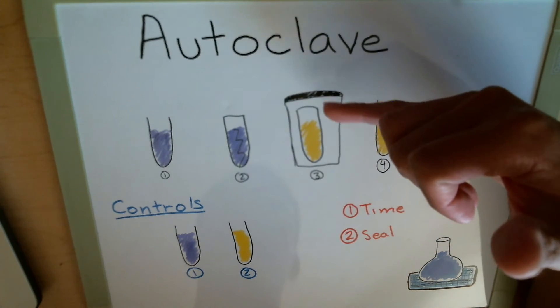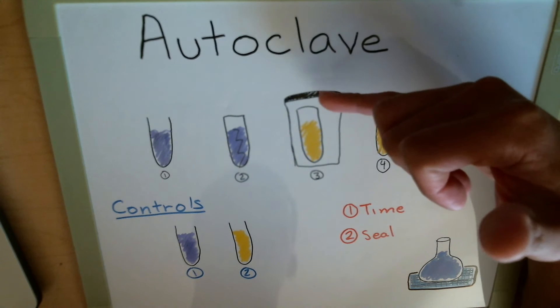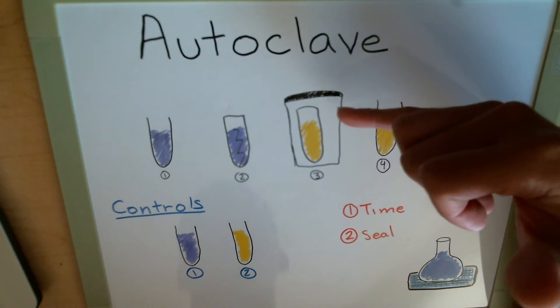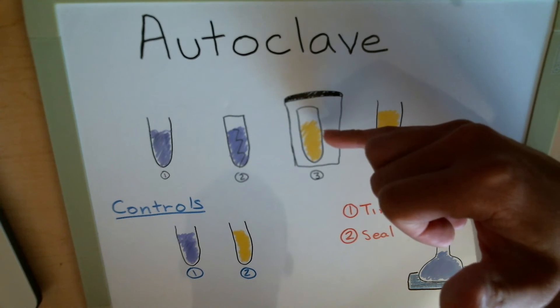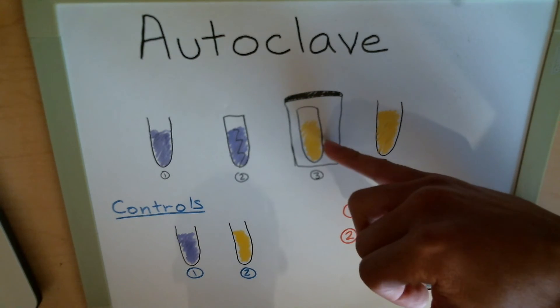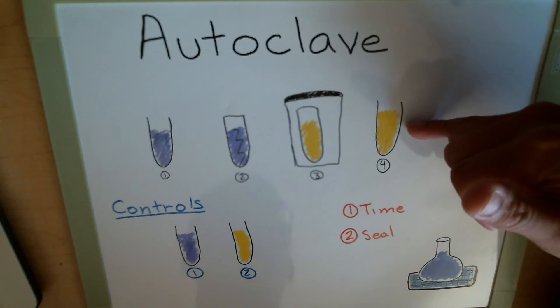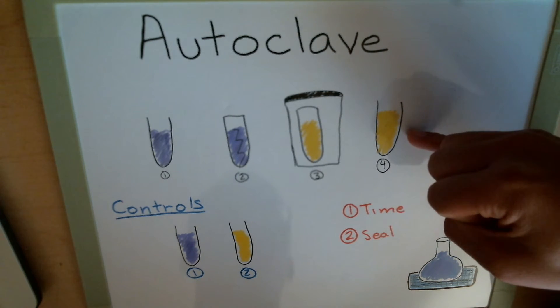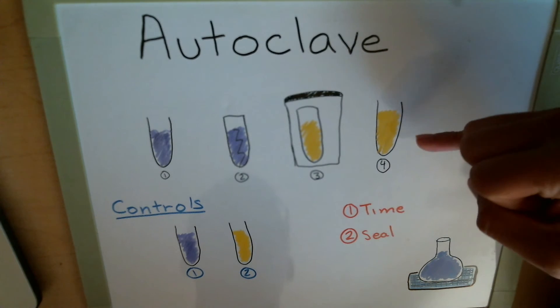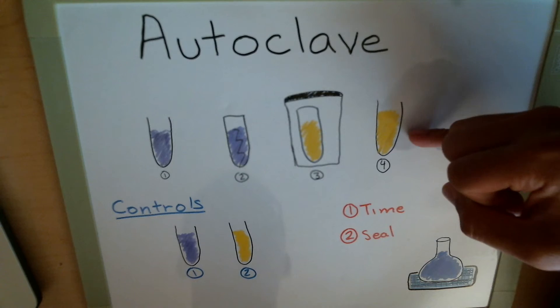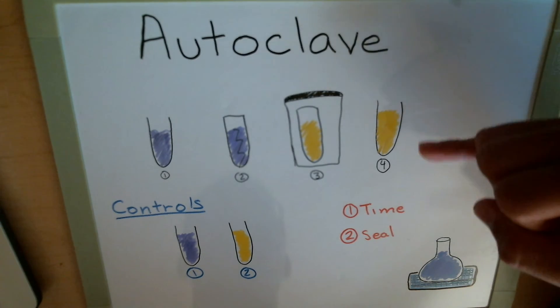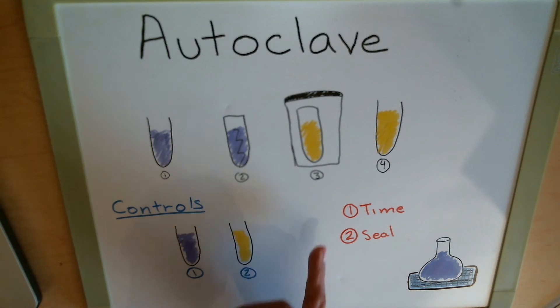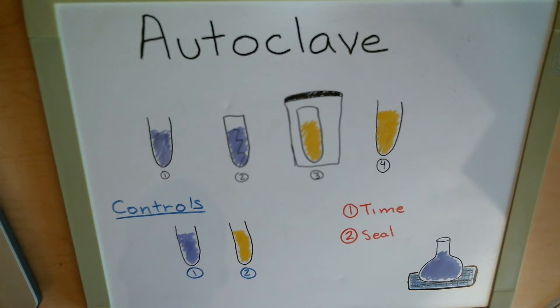In sample three, we have a sealed test tube inside another sealed canister — the steam wasn't able to enter even the first canister, so it can't reach the bacteria, and we do have growth here. Sample four is an interesting case: the tube is unsealed, but it wasn't put in for a long enough time. How does insufficient time result in a positive result? Feel free to shoot me an email on how proper time and sealing play a role in the autoclave.